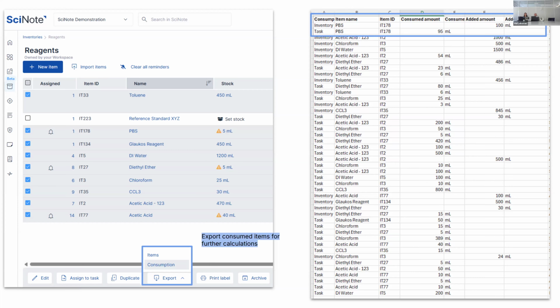What you need to be aware of though is, I know somebody asked this question at the previous webinar, and I didn't want to go into details here. You can create custom labels, but it's not as straightforward. If you have questions about that, please reach out to Blaszka and her team. You can also reach out to me, and we're going to take you through how you can design custom templates, because it's not as straightforward as just having this on the webinar. But the information that you see here can be customized. You can see it's very different from the default template.